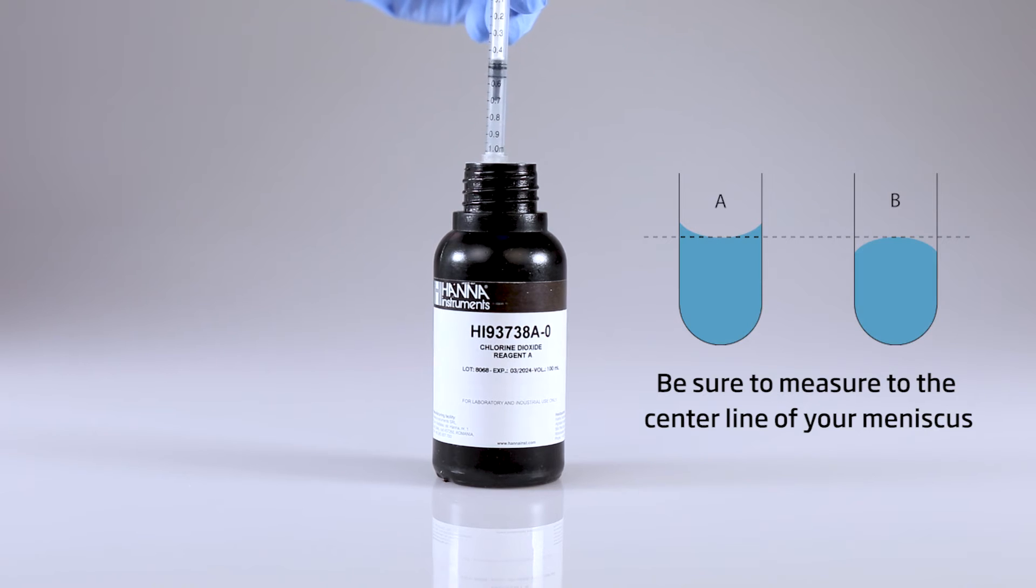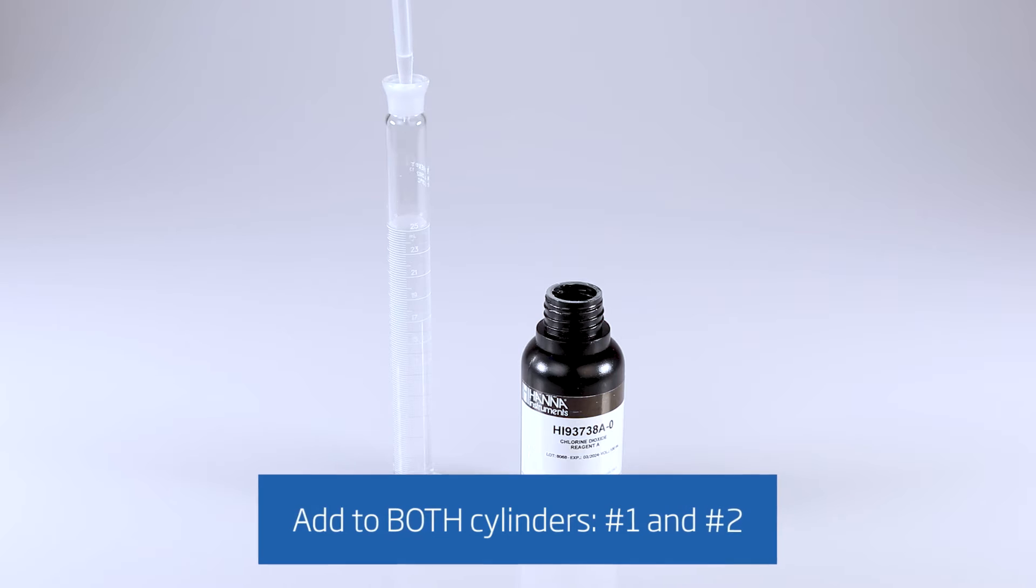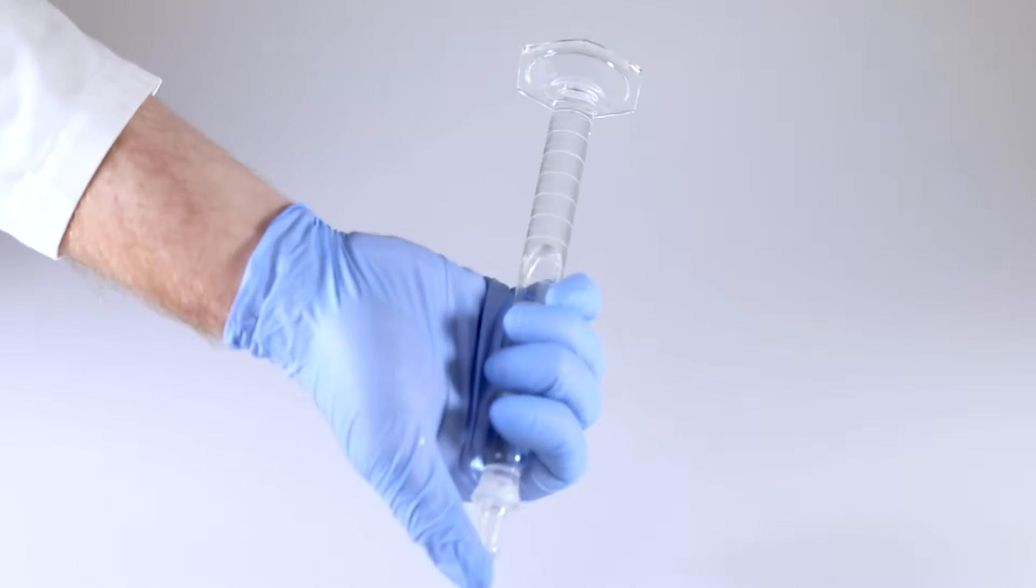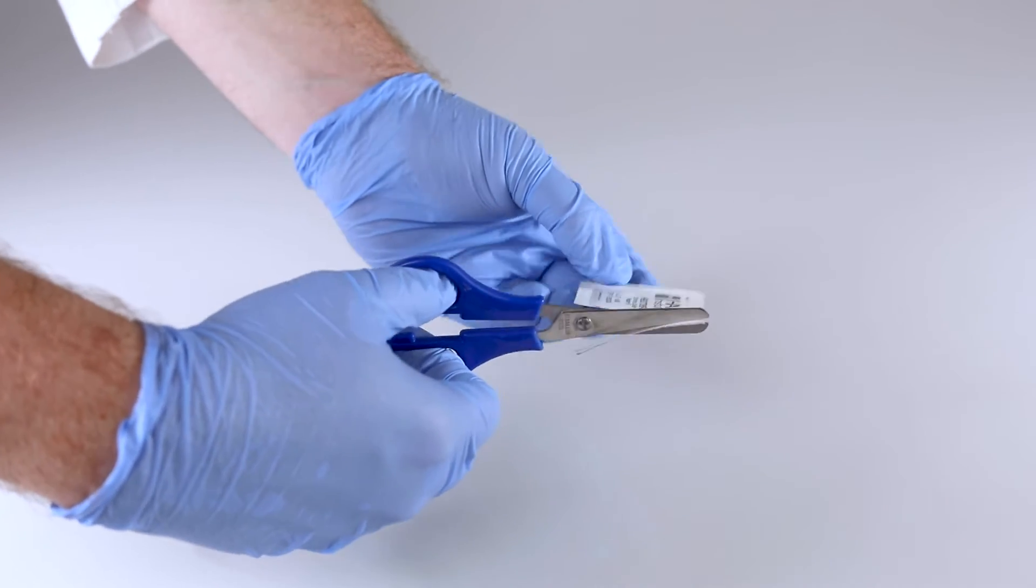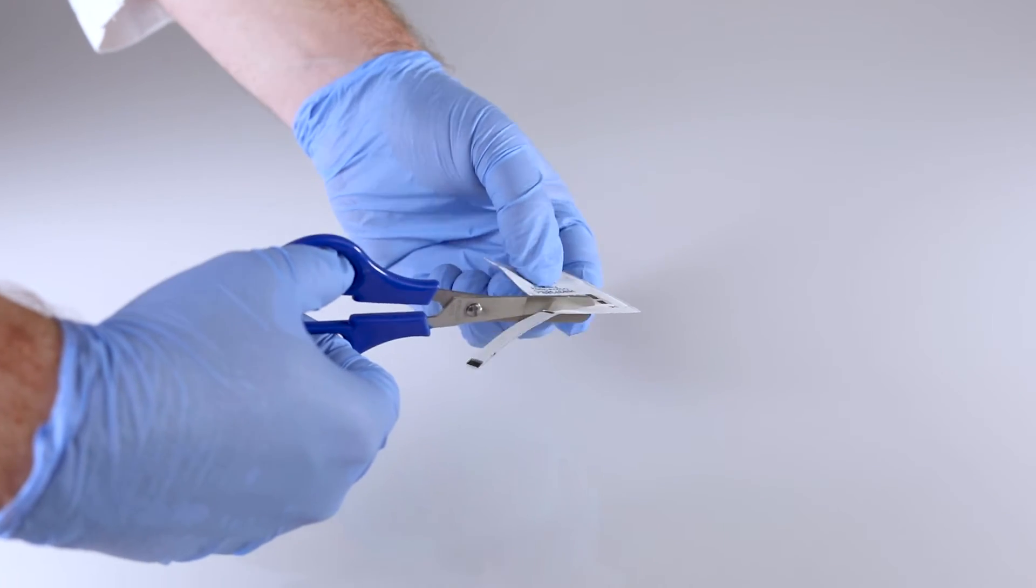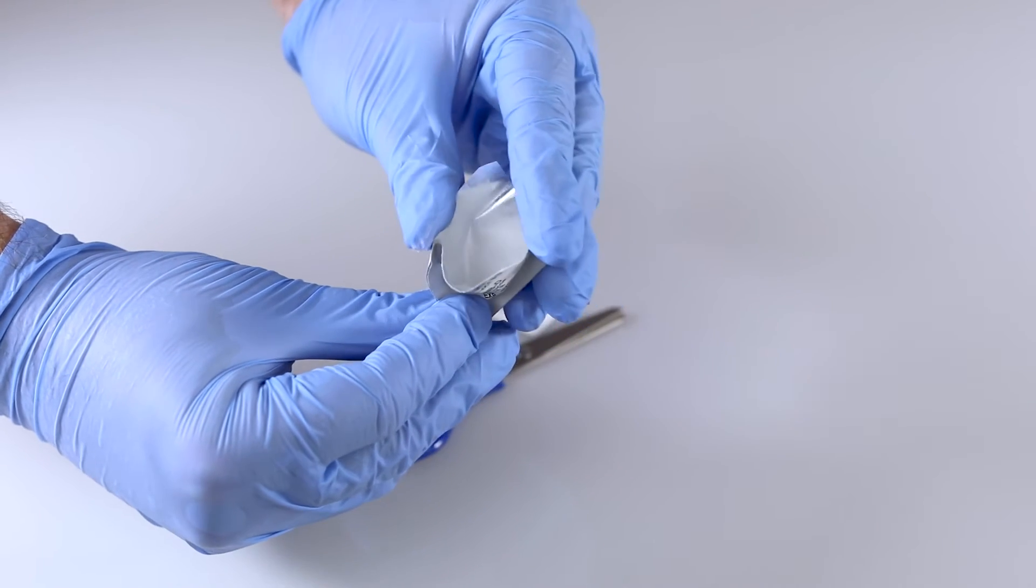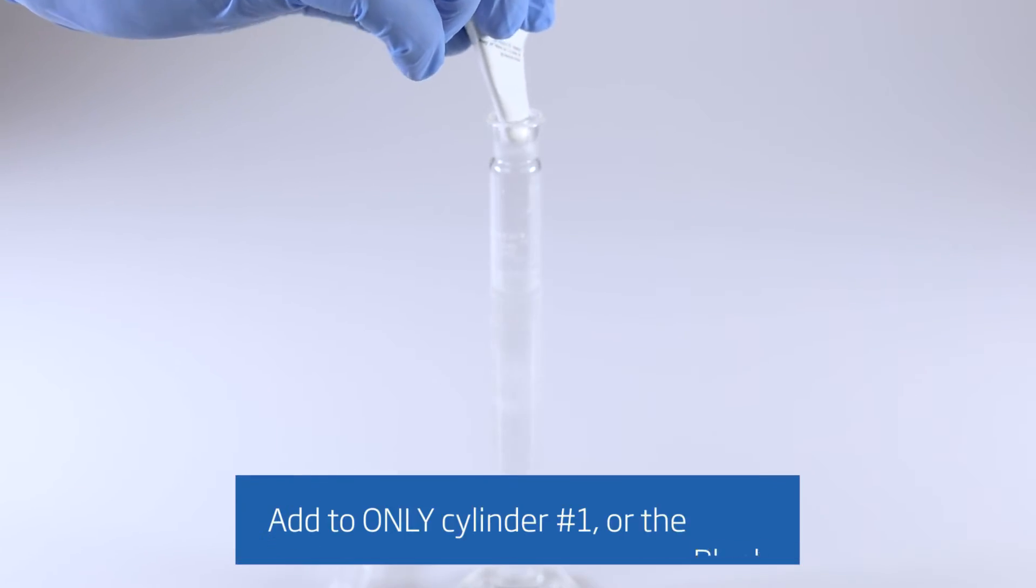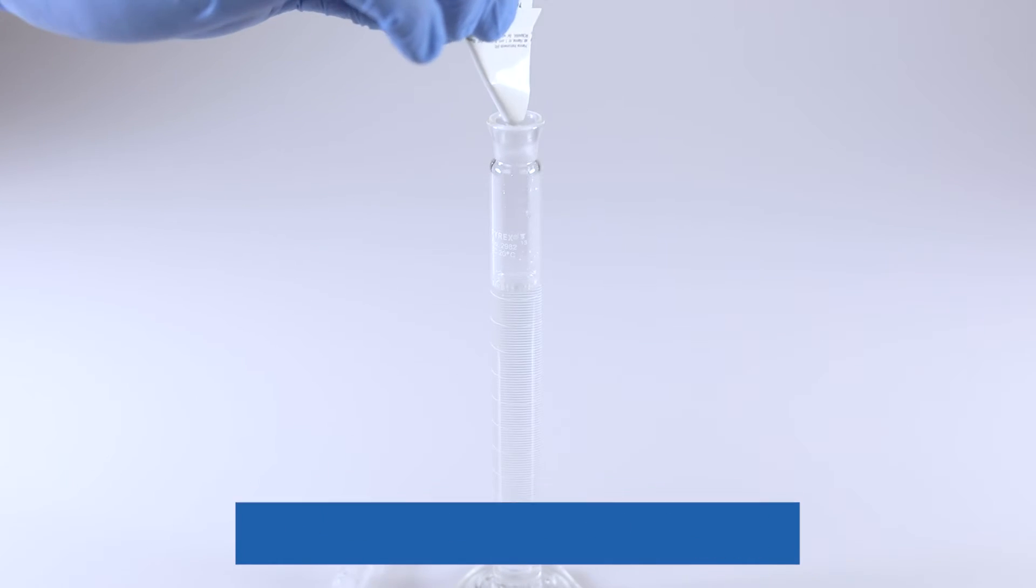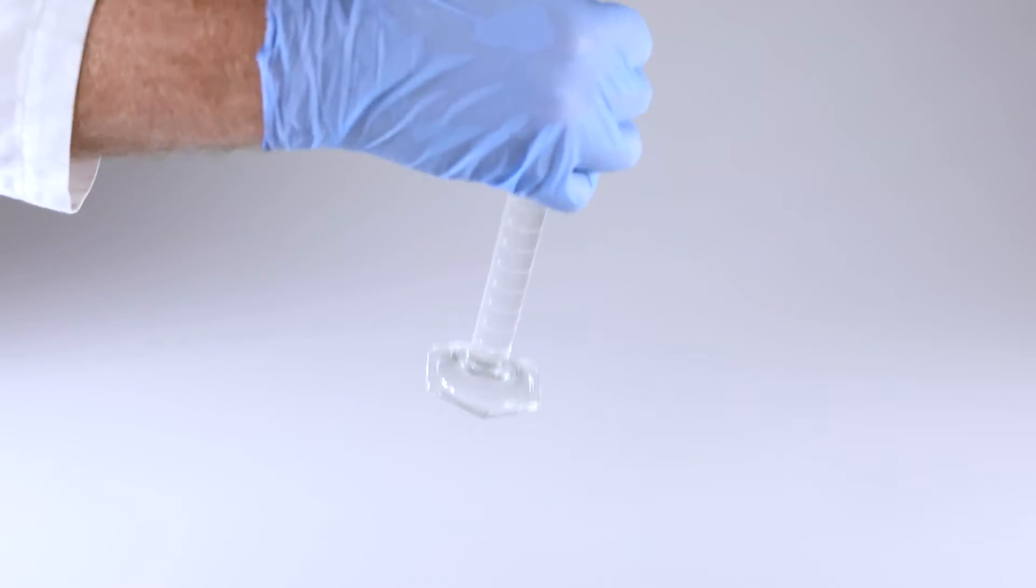Using a one milliliter syringe, add 0.5 milliliters of reagent A to each cylinder. Cap the cylinders and invert several times to mix. Now, take one packet of reagent B and carefully cut along the dotted line using your provided scissors. Pinch the corners of the open packet to form a spout. Add the entire content of the packet into one of the two cylinders, cylinder number one or the blank cylinder. Cap the cylinder and invert several times to mix.